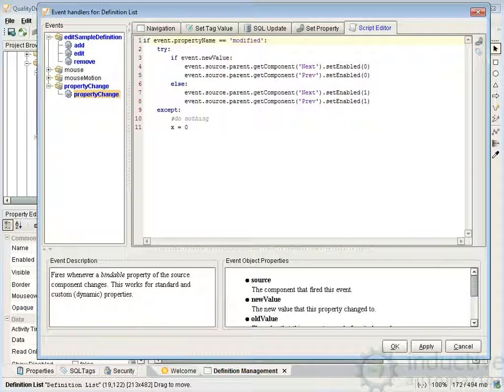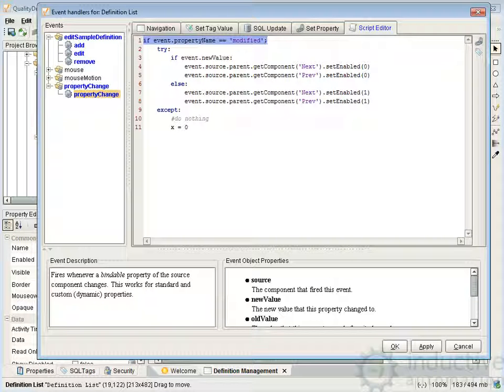The property change on that table just prevents us from navigating off the screen if we made some changes. When we make changes to a definition it has a modified field — whenever that changes, the script checks for that modified flag. It looks at the new value: if the new value is one, meaning we just modified it, then we disable our next and previous buttons along the top to prevent navigation. When it's actually saved — we click the save button — the modified will go back to false and we'll re-enable those buttons, allowing navigation.